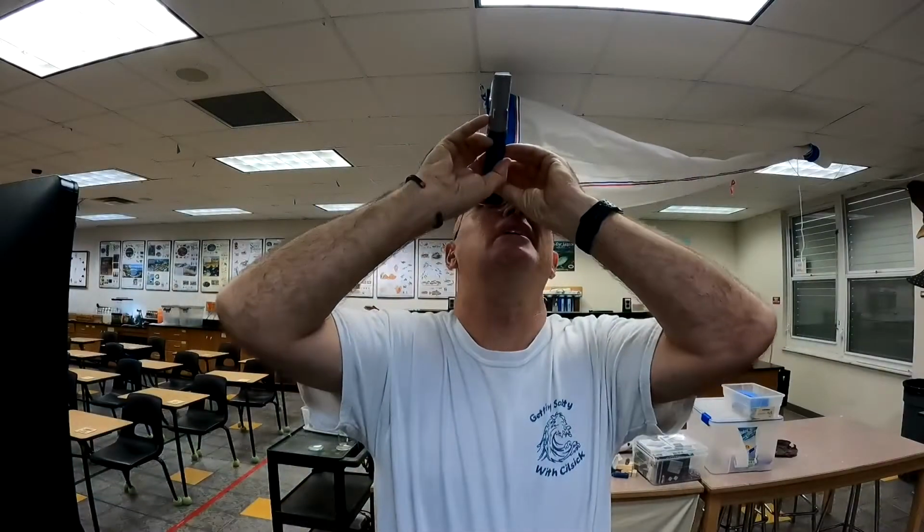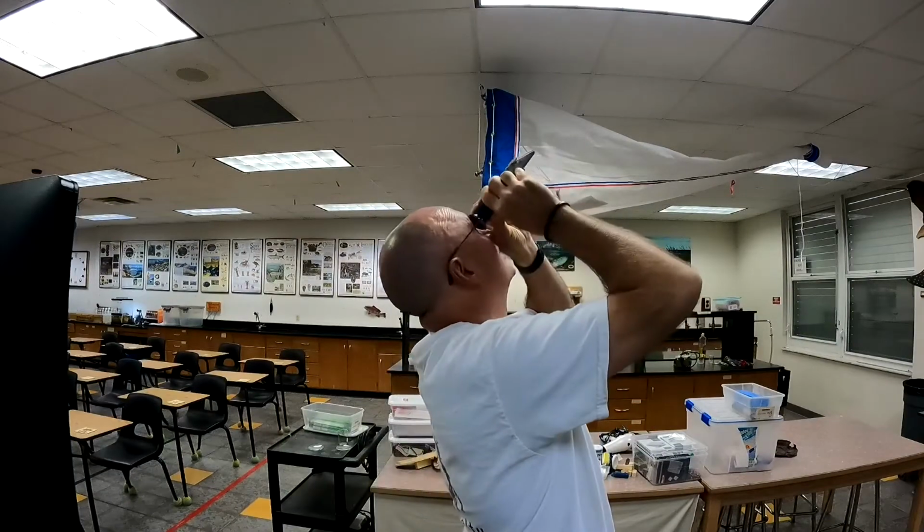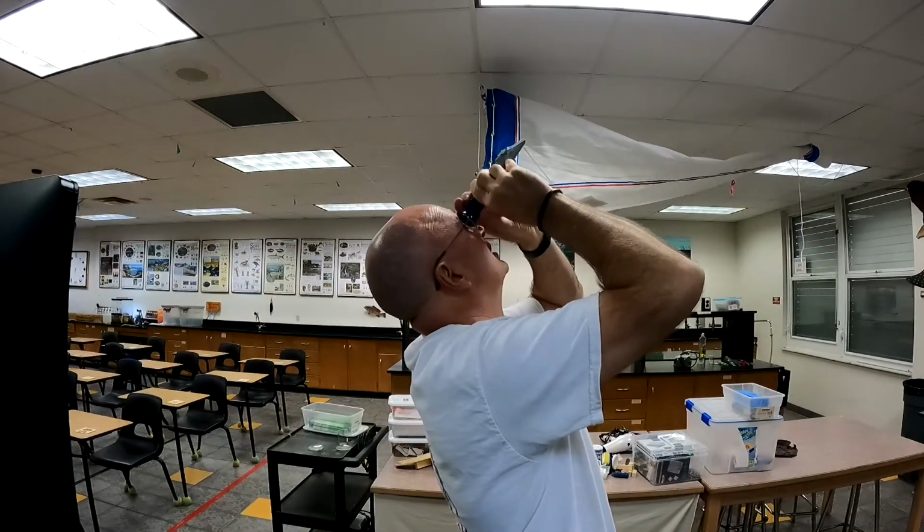Salinity is on the right scale, so look at the right scale. Pretty easy to use. When you're done, open this back up, dry it off, and put it back down.